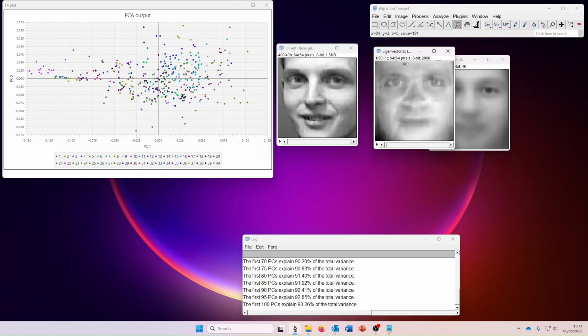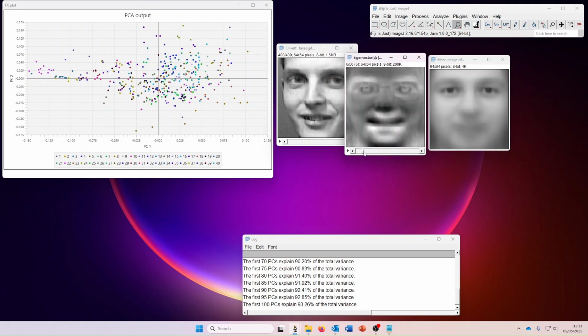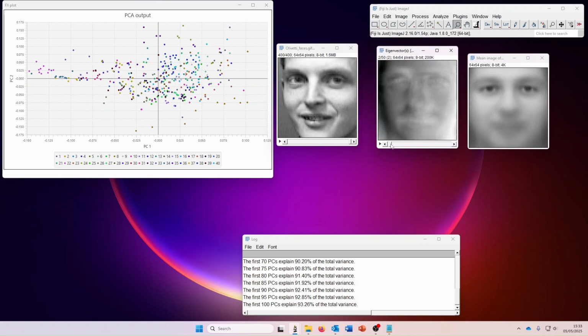Now the eigenvectors, this is even more ghostly. This encodes some information naturally with respect to this data set. It isn't always going to be so natural, we aren't always going to be able to intuit the meaning of these, but for face data, it has a natural representation.